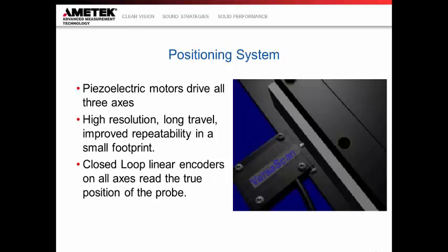Contrast that to some stepper motors that are often seen with backlash and some different types of negative consequences of the way that a stepper motor turns a screw to make those positions. These are all piezoelectric systems on X, Y, and Z that are giving you 100 millimeter travel and 50 nanometer resolutions.